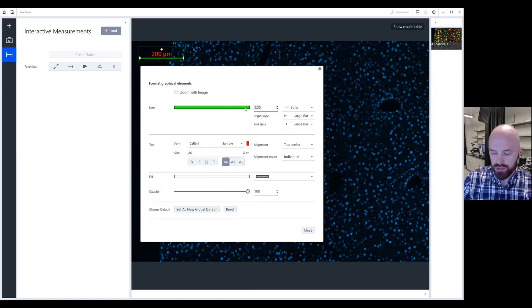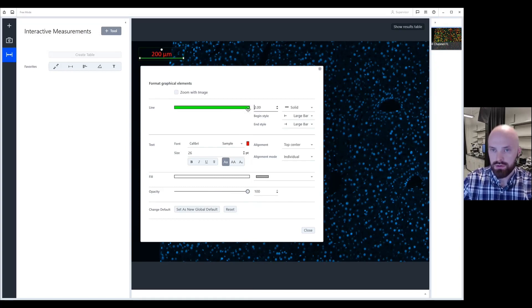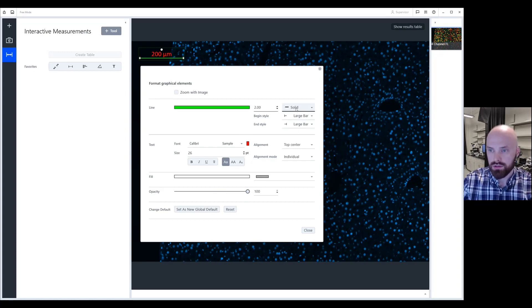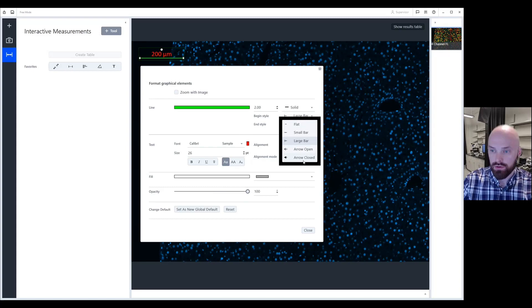This allows you to change the weight, so the size of the scale bar itself. This allows you to change the style of the line and the end caps either large bar flat or arrows.